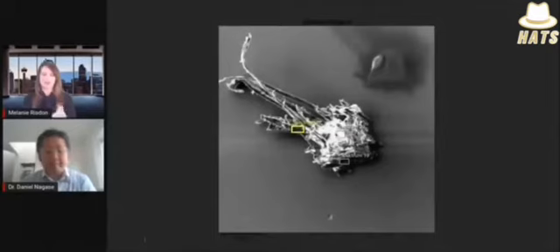This is the next image that you shared with me. Let's get into what this looks like to you. So when I first saw that image, I thought, oh, well, that could be anything, right? That could be a mold spore that is starting to sprout little legs, because mold spores eventually will grow into a mold or a mushroom. So, when a mold spore sprouts, it has to start growing little roots. That could be what it is, right? And that's what it looked like to me initially.